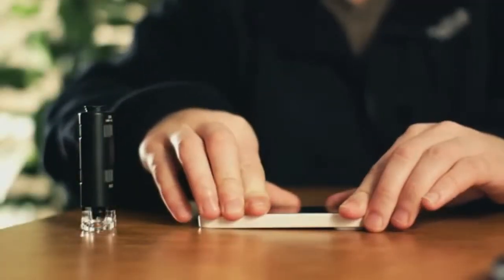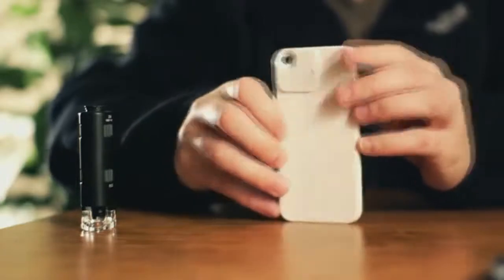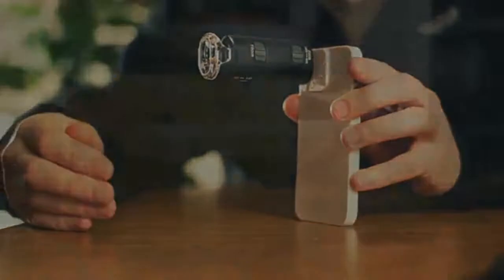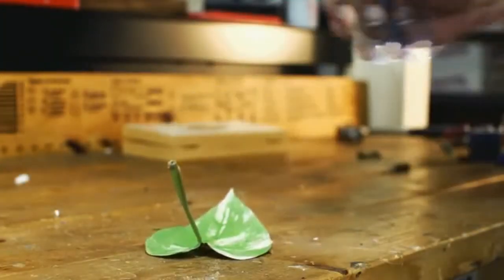Just clip this adapter onto the back of your iPhone, then attach the included Micromax right onto the adapter. You can even use the Micromax by itself without any need for an adapter or phone.